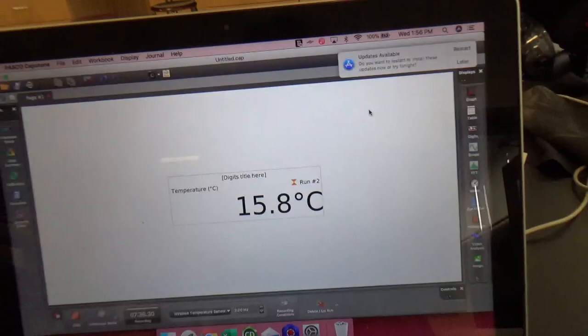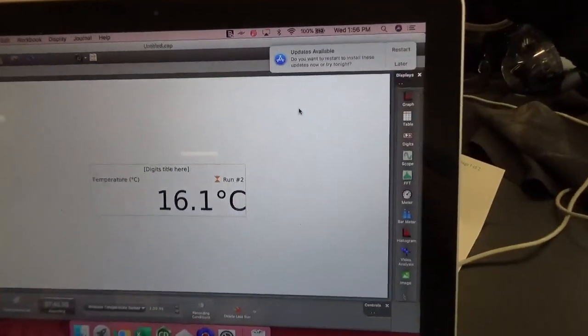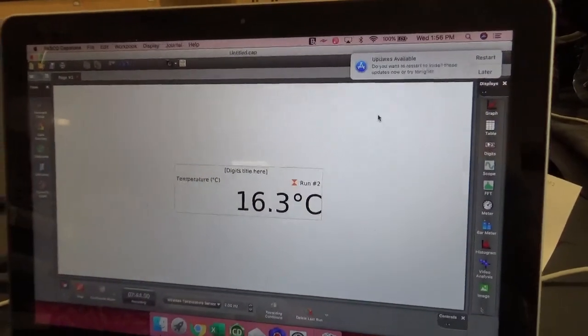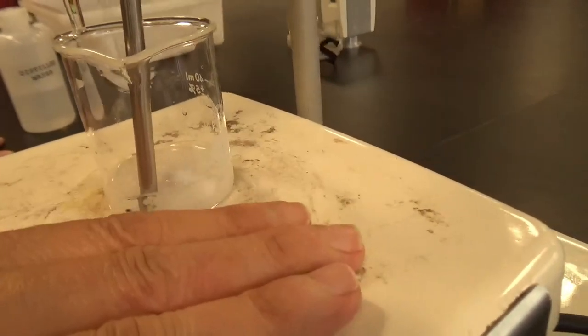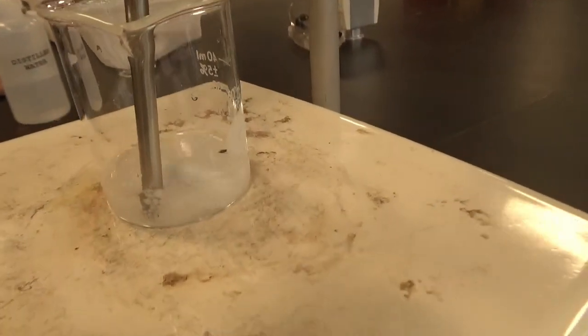Feel it. It's actually warm. It's actually too hot. Oh wow, it's very warm. This is going to go above. See, I burn food sometimes on my stove. Show them this. So, you can't see much. It's just stirring, but can you feel the heat on that little bit? Yeah, can you feel the heat? This is feel-o-vision.